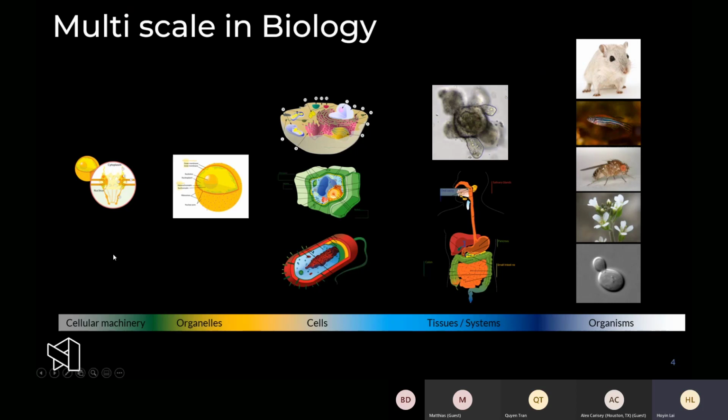Those nuclear pores are part of the nuclear membrane, and the different organelles, like the nucleus or the mitochondria, all get organized into a higher level that we all now know as a cell, which has the nucleus, the mitochondria, and all these different types of vesicles.